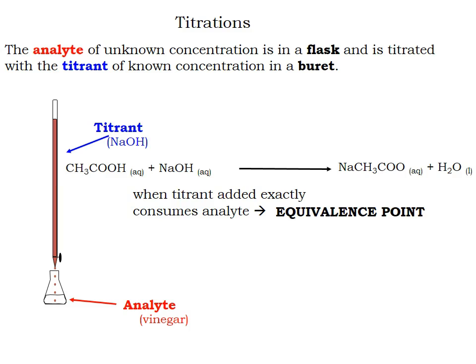If we know the volume and concentration of titrant that's required to exactly consume the analyte, then we can determine how many moles of analyte were there in the first place, because we have the balanced equation and we know how many moles of titrant we have added.